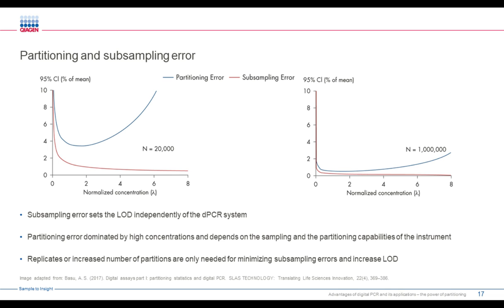That means that if, for instance, you're taking a blood sample from me, 5 milliliters of blood, in my volume, which is 7 liters of blood, and of course, if you have a rare mutation that you're looking for inside my body, the chance of you actually missing it when you just take 5 milliliters of blood out of 7 liters is quite big.